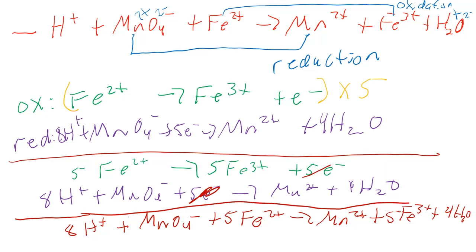You're going to titrate this until the pink color stays in your Erlenmeyer flask for at least 20 seconds. And then you're going to repeat the titration 3 more times with a fresh iron solution in order to make sure that your results are reproducible.